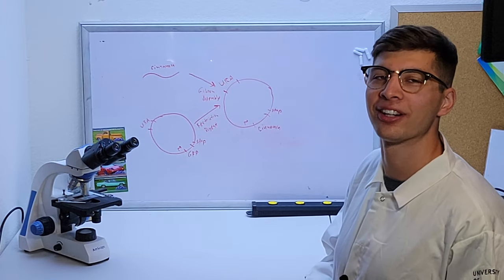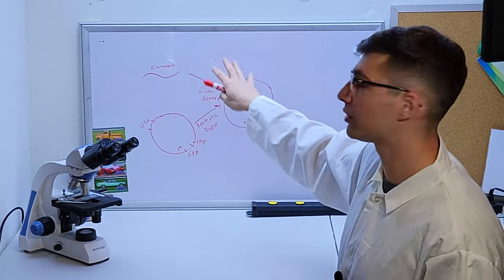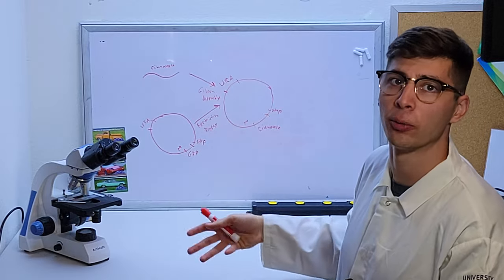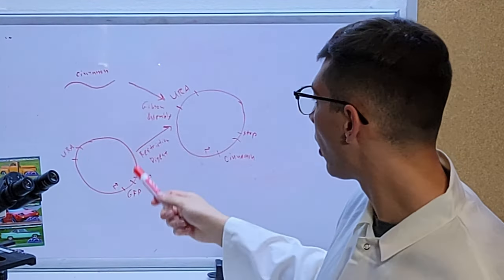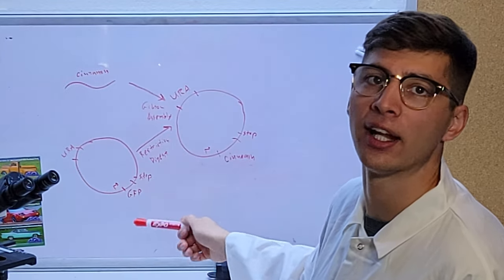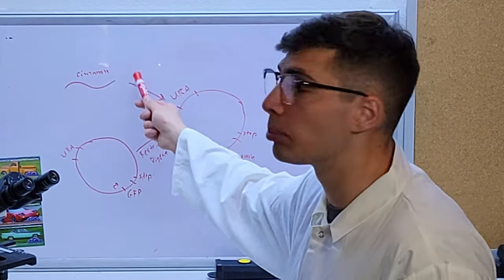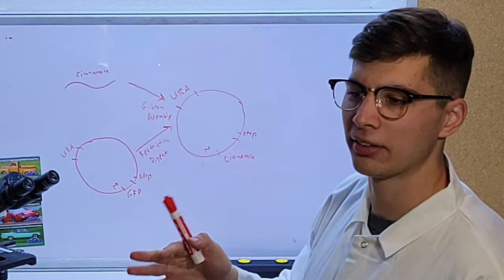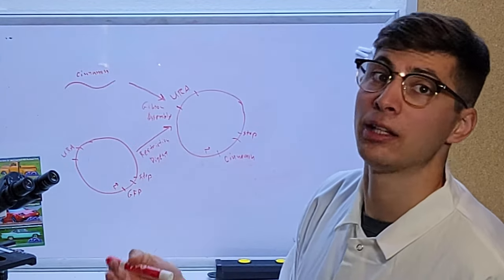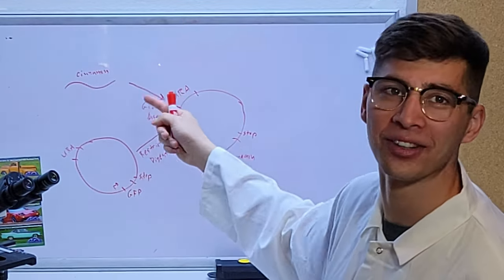So we'll actually see this in the computer in a moment — it's going to be really cool to see this terrible drawing come to life with actual DNA sequences. We already have this one plasmid that contains GFP. We need to get rid of our GFP gene and instead replace it with our cinnamon gene. In our case, we're actually able to print the cinnamon genes. It will cost about $2,000 to print all three genes, which in the grand scheme of things isn't very much money. It's kind of interesting that you can just go online and order the genes that you want to be printed.